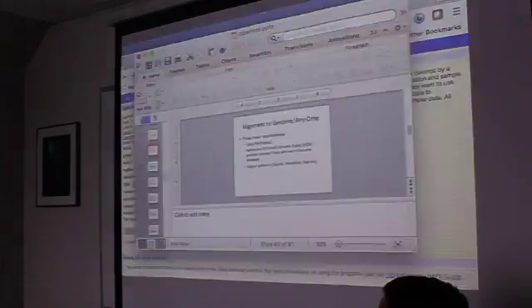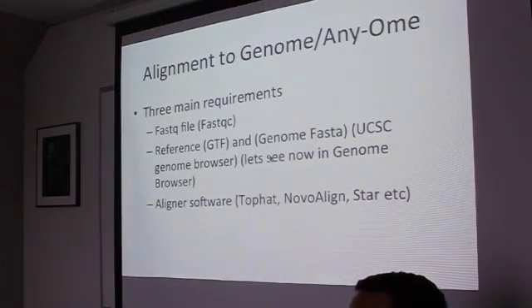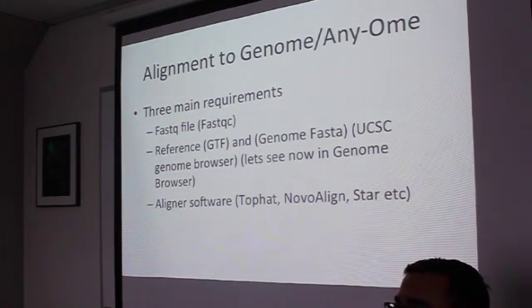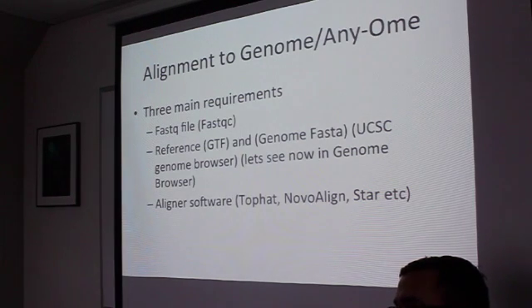Just a quick question on Iris one: if you have a model organism that's not on Iris one, can you upload that and keep it? Yeah, sure. Does that become publicly available? Not necessarily. If you keep it in your public folders, then it is. Remember the permissions. If you put it just for your lab, then you can have your own version.